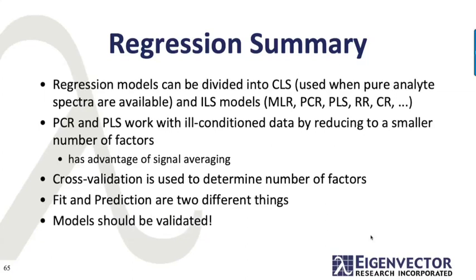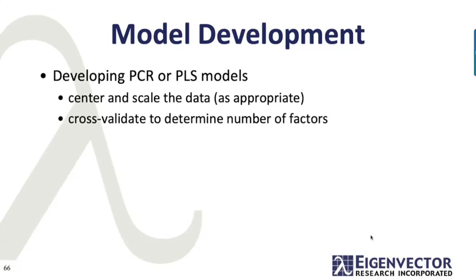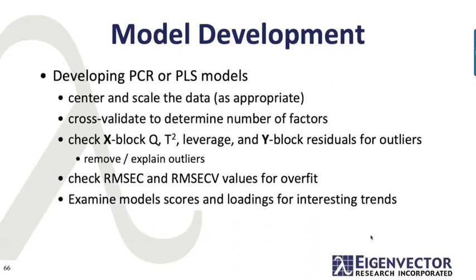And you should validate your models. So some resources, model development first. When you develop your model, you center and scale data as appropriate, you cross-validate, you check X block Q and T squared, Y block residuals for outliers, and then either remove or explain them or possibly get more. Look at your error cross-validation versus calibration and see if it's overfit.